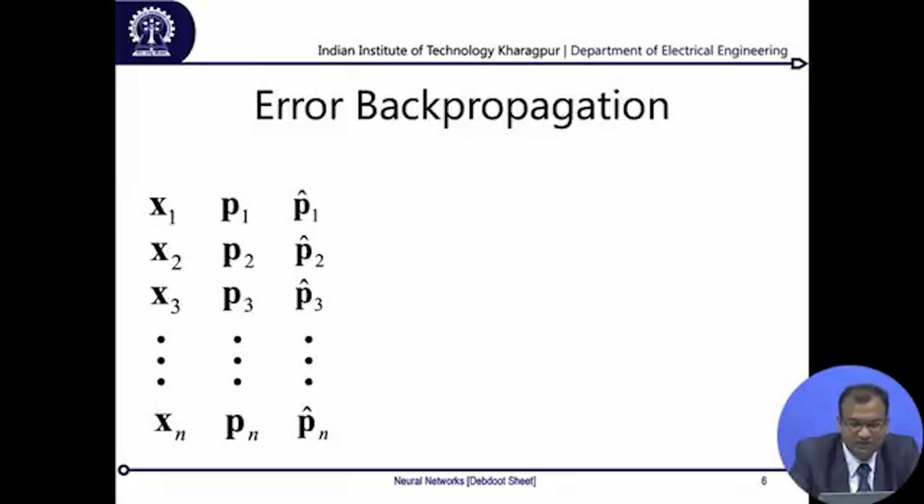Later in the class, when we do the coding exercises, we will take a very simple example in which we take microscopic images of white blood cells, and we predict whether each of these WBC images is cancerous of a particular kind, which is acute lymphoblastic leukemia, or not leukemic in any way and perfectly normal. So this is what we are going to do.